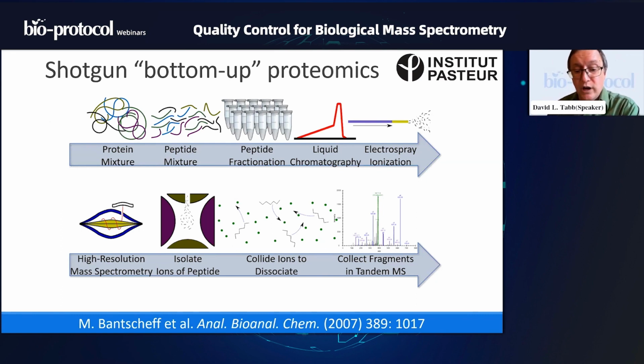In general, we are performing in shotgun proteomics 2 kinds of mass spectrometry. One is usually to do a high resolution mass spectrometry experiment where we simply ask which ionic mass to charge values are available to sample right now at this instant in time. A single LCMS-MS experiment will typically last like 90 minutes, of which at least an hour is a slow gradient as we increase the hydrophobicity. So at a given moment in time, we need to know which peptide ions are available right now.